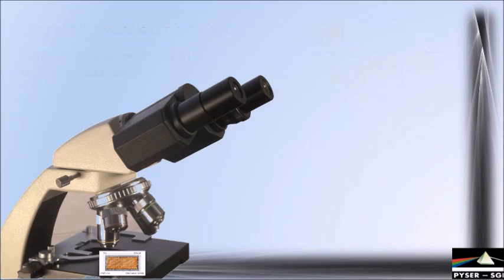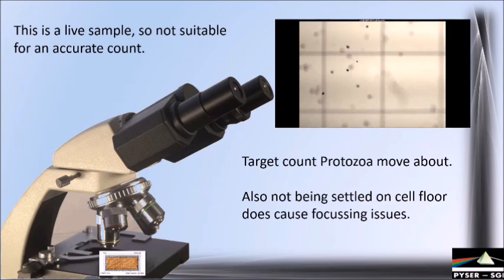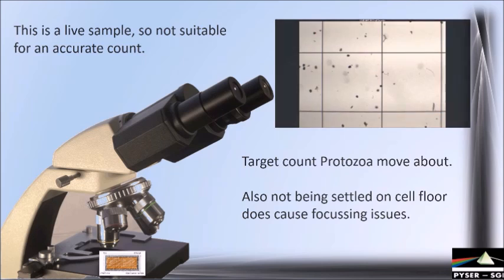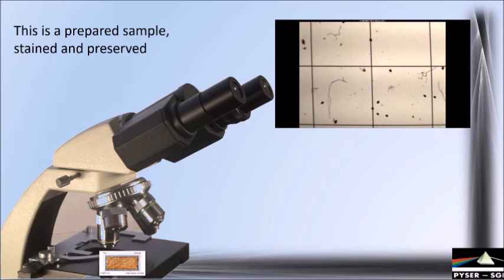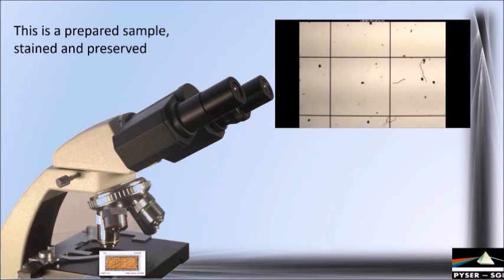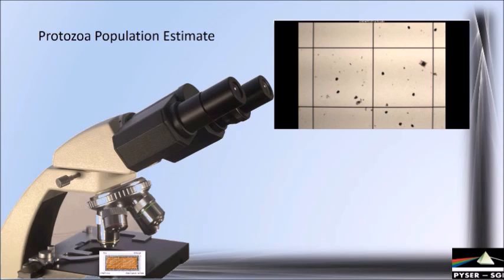These are live samples, and there are obviously difficulties in getting an accurate count. The first thing is that the protozoa are moving around and swimming within the one millimetre depth of the water, so some are in focus and some are out of focus due to depth of field. What we really need to do is preserve and stain the sample so that everything sits nice and still — or, if you prefer, dead. Lugol's is a good agent for this, but it can be detrimental to the larger animals in the sample.